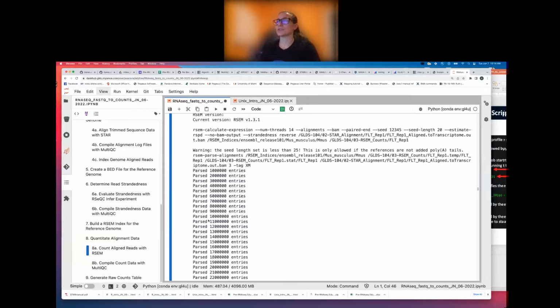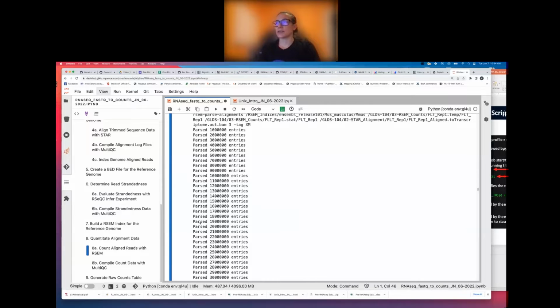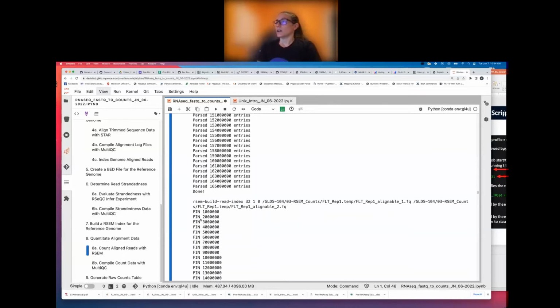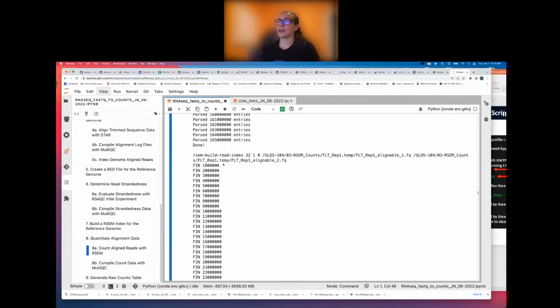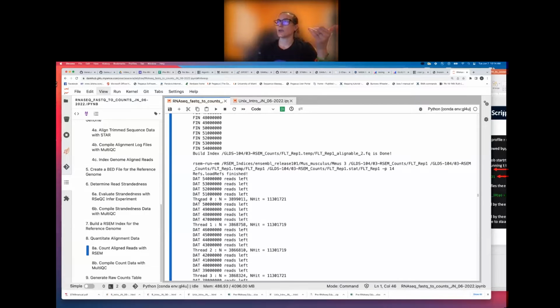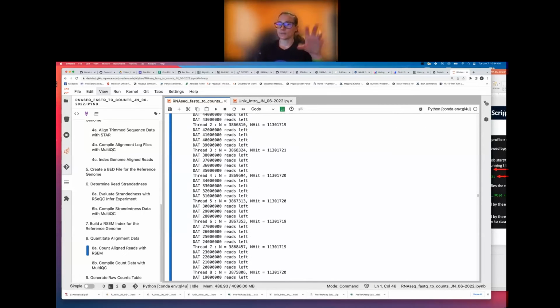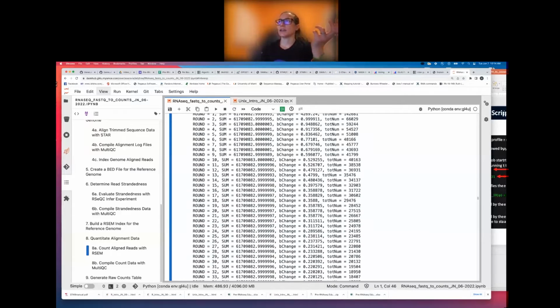And then it basically goes through and gives you a log of the output, such as how many entries or templates it's looked at so far, and that's why this is very long. Then there's more information as it goes through the index and the different annotations within the index, looking at different aspects of the genes identified in the index, and giving you log output. I skim through these. It's basically just saying that it's quantitating the different gene annotations in the index, and I skim through just to make sure I don't see any errors or anything like that.